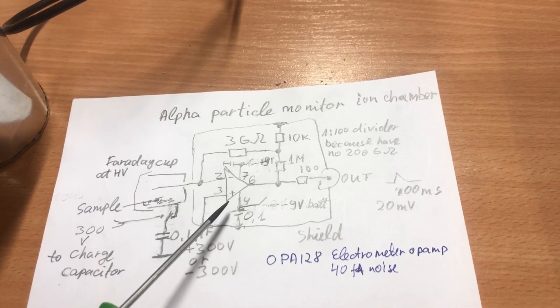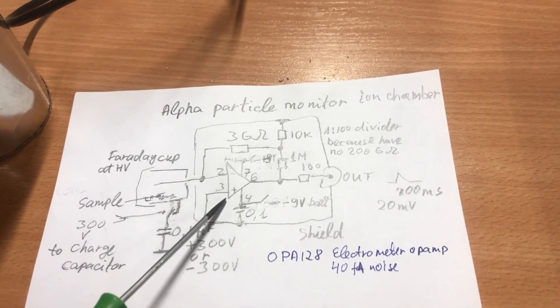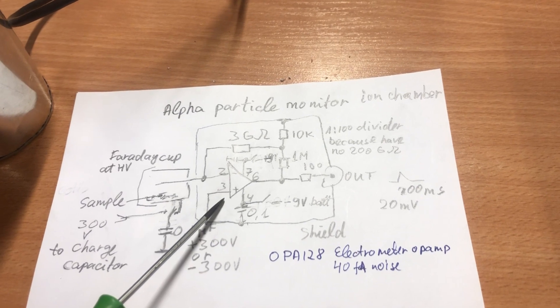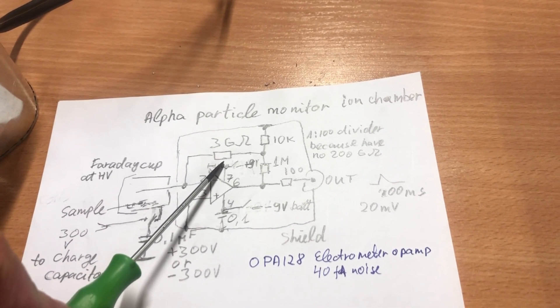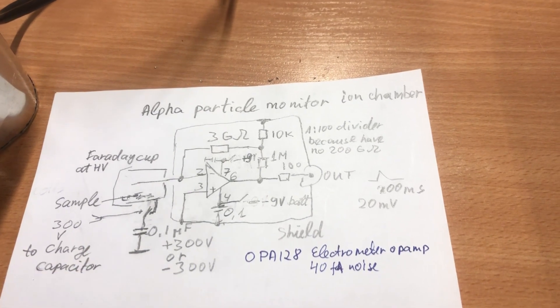Circuit is based on electrometer operational amplifier. Feedback resistor is 3 gigaohm because I did not have 200 gigaohm.